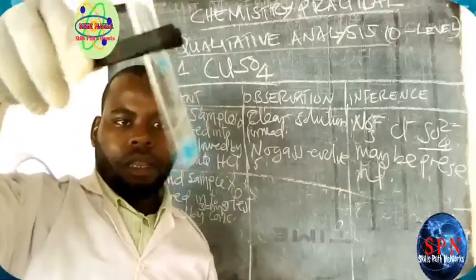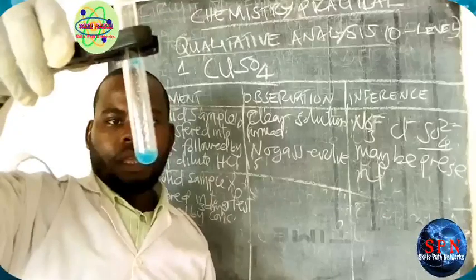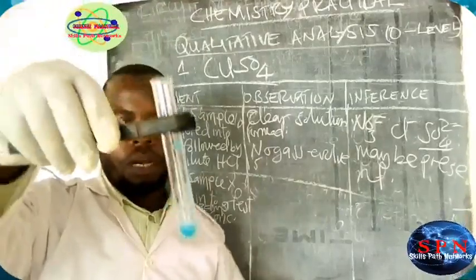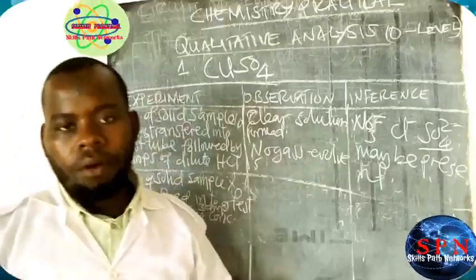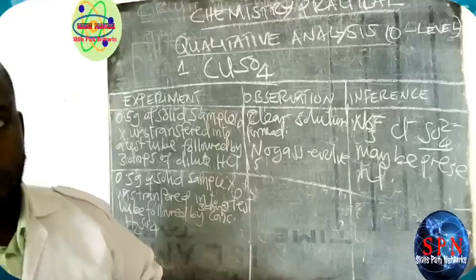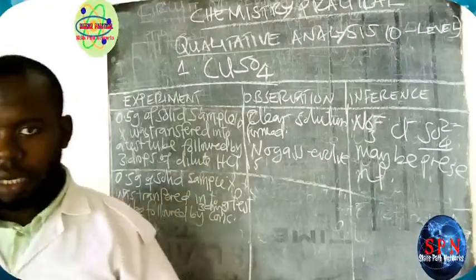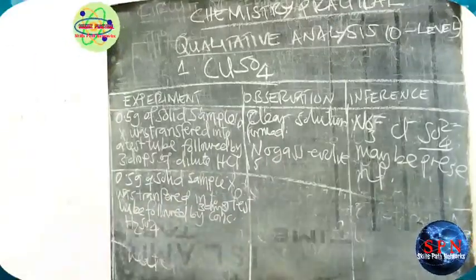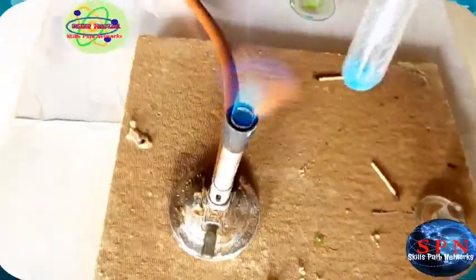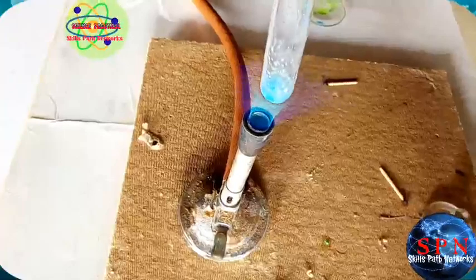And actually, even not heating, our sample is going to turn white. Or when you heat, it is also going to turn white. Let's see on heating.